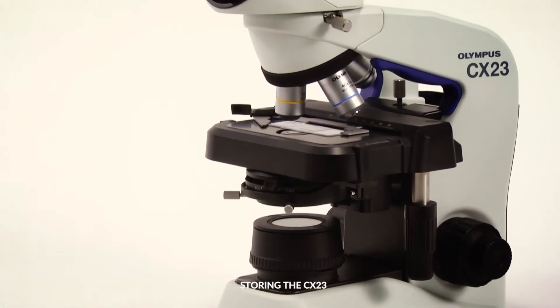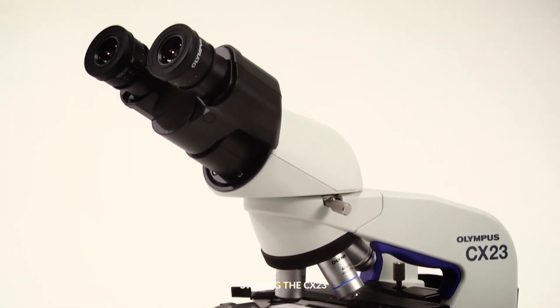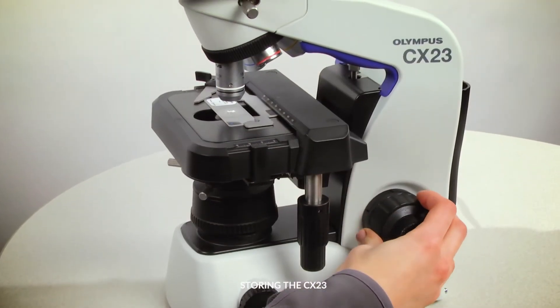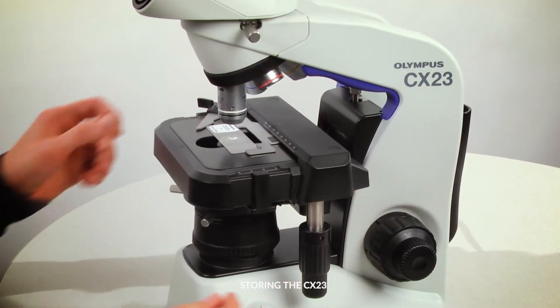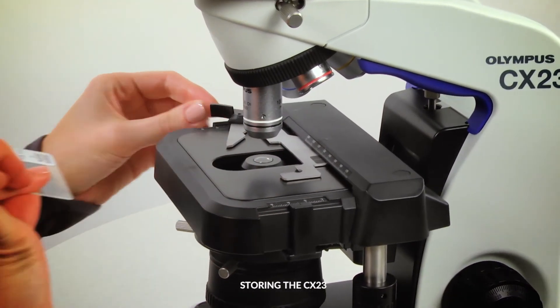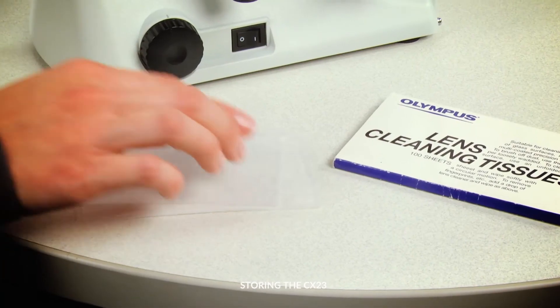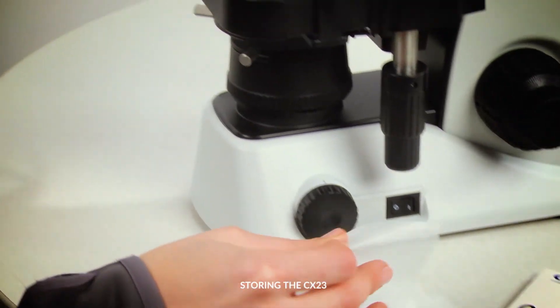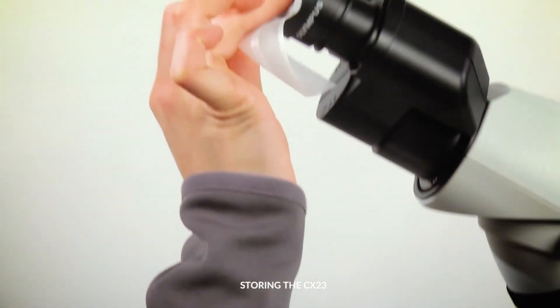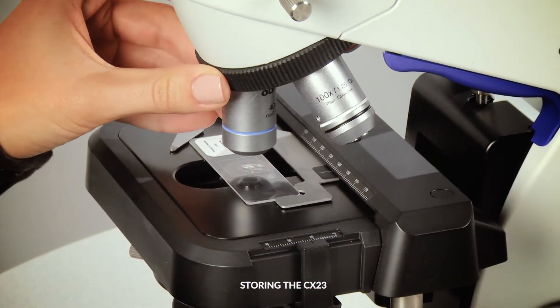When finished with your CX-23 microscope, it is important to properly clean it before storing it away. Start by lowering the stage and remove the slide from the stage clip. Turn off the LED. Clean the objectives and eyepieces with lens paper. If oil was used on the 100X objective, revolve the nose piece to remove the objective from the sample.